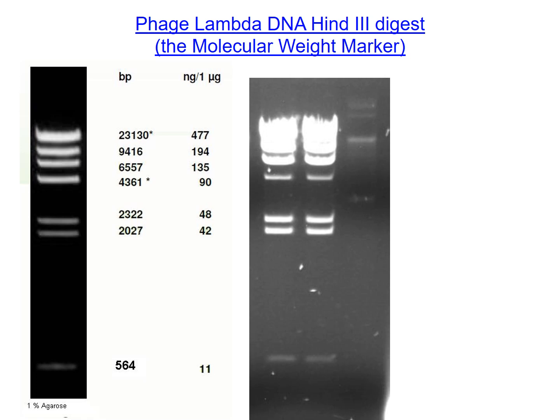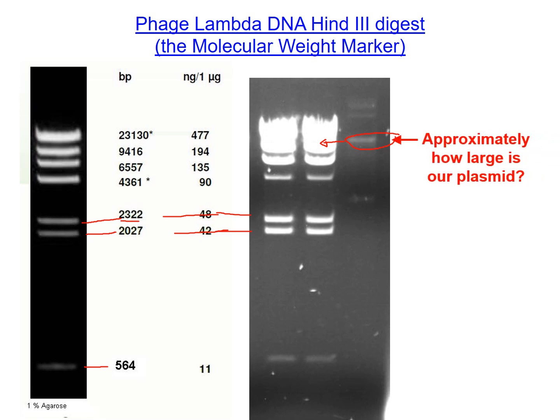Here's the molecular weight marker. You can see bands representing certain sizes: 2,322 base pairs, 2,027 base pairs, and a smaller fragment down here at 564 base pairs. I have our gel lined up right here so you can see the sizes. Our plasmid is somewhere a little more than 9,000 base pairs — so maybe around 10,000 base pairs, give or take. It's a little hard to tell because we loaded a lot of molecular weight marker and the bands kind of smeared together, but I'm guessing around 10,000 base pairs.